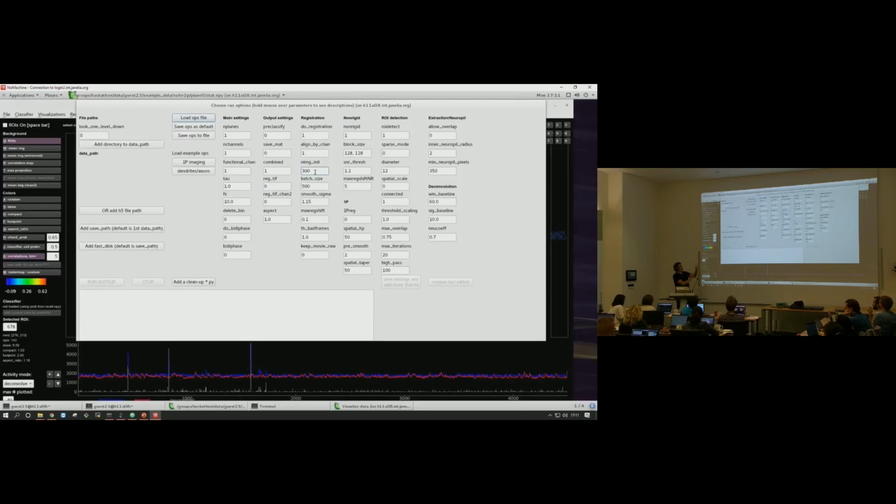A set of a few hundred frames is already pretty good in most cases. If your data is relatively low SNR, you might want to use more, just to take advantage of averaging over frames, to remove some of that shot noise. But with more frames, it will get slower and slower because it's doing this iterative optimization, going like 5 or 10 times and realigning every frame to the target.